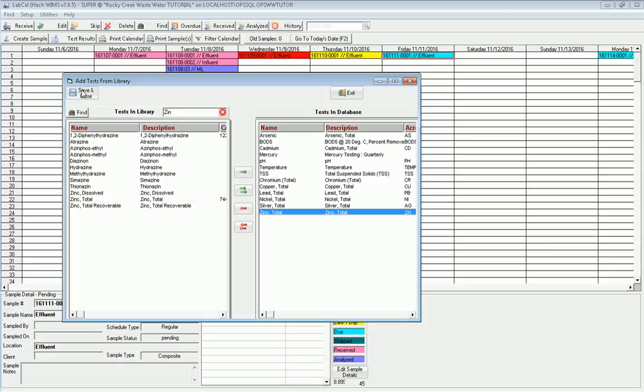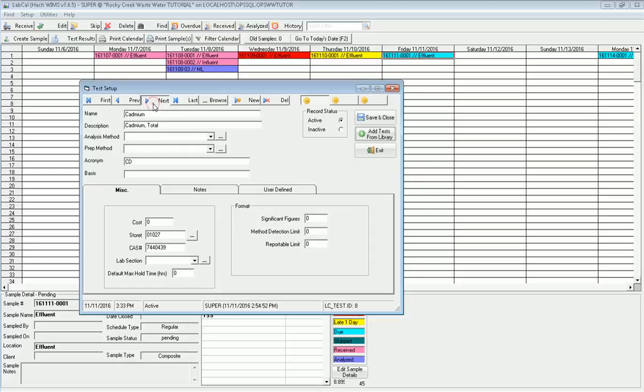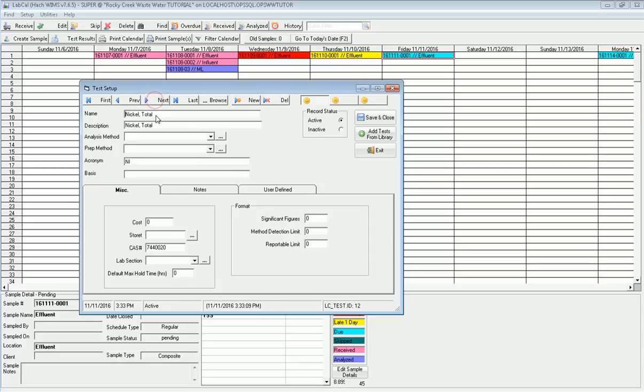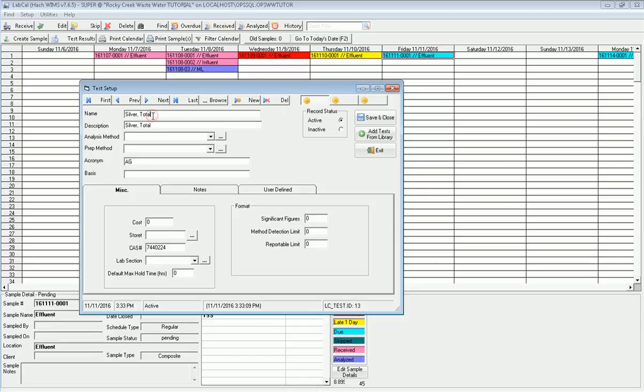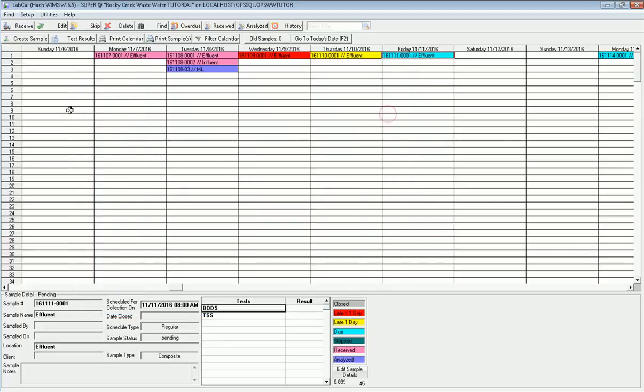I add those tests in, so I'm saying the lab can do it, and now when I set up samples, I'll be able to do it. Now, I may want to give a shorter name to them. In this case, I don't need the word total there as far as the name goes, because I know that's the only test I run. It makes it just a little shorter when you're displaying it in reports. I'm going to go ahead and fix these up. And there's my last one, zinc. I click save and close.